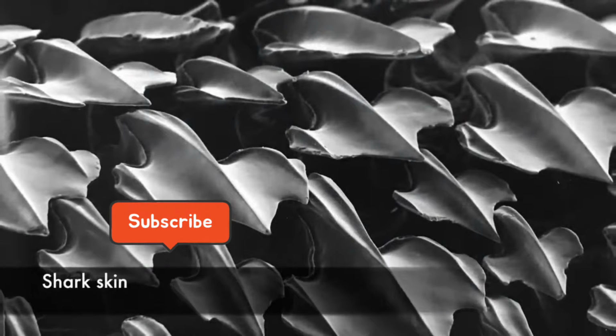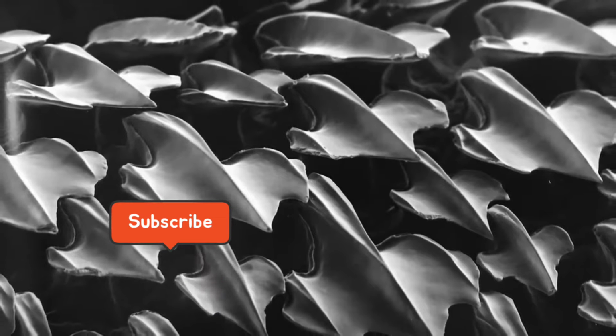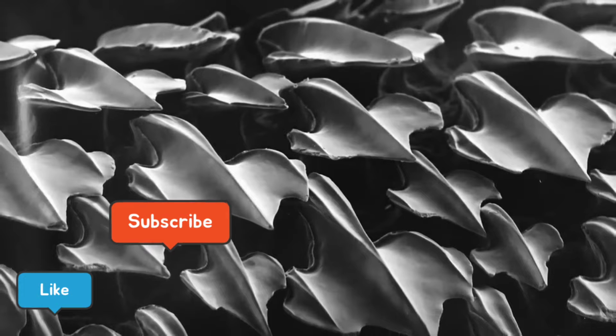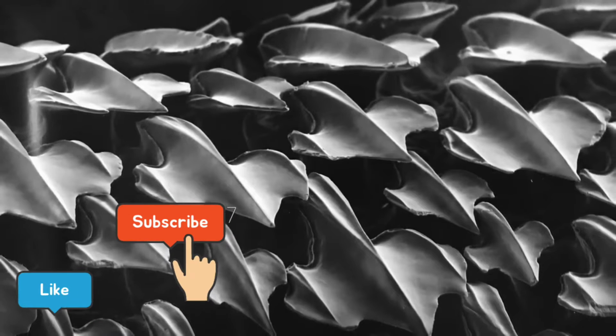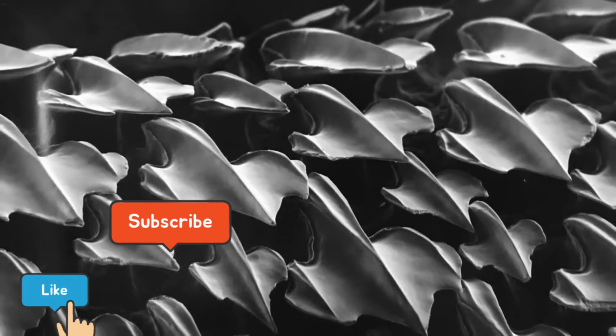Shark skin is almost entirely covered by small pointed placoid scales. The scales, also called dermal denticles, are supported by spines, which feel rough when stroked in a backward direction, but when flattened by the forward movement of water create tiny vortices that reduce hydrodynamic drag and reduce the turbulence, making swimming both more efficient and quieter.